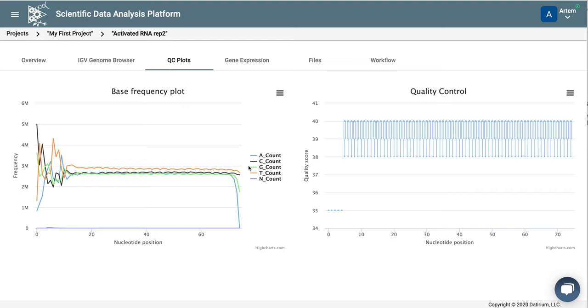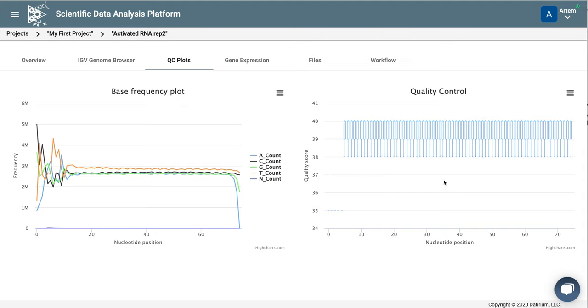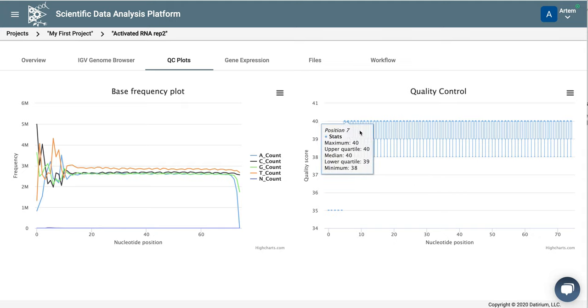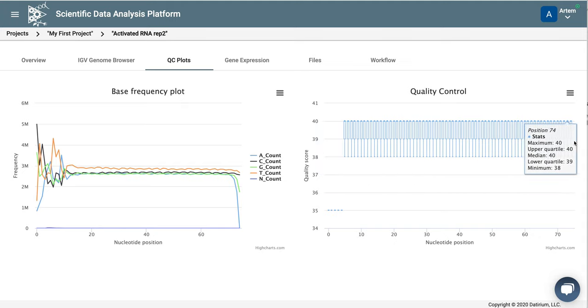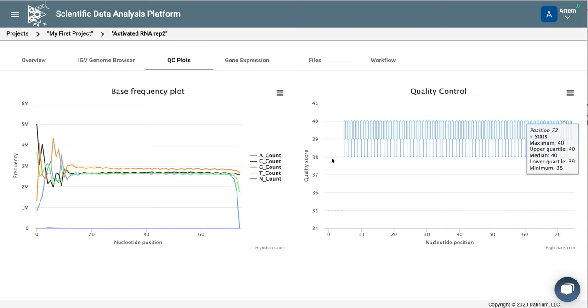The second quality control plot just shows the average quality at each base. So in this case, it looks like pretty good sequencing quality.